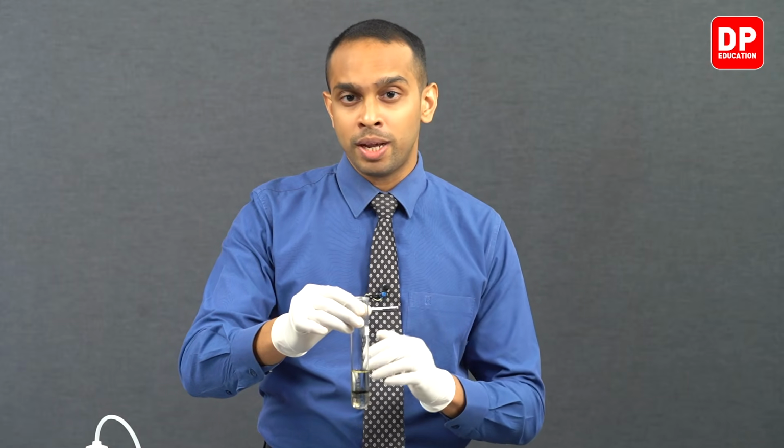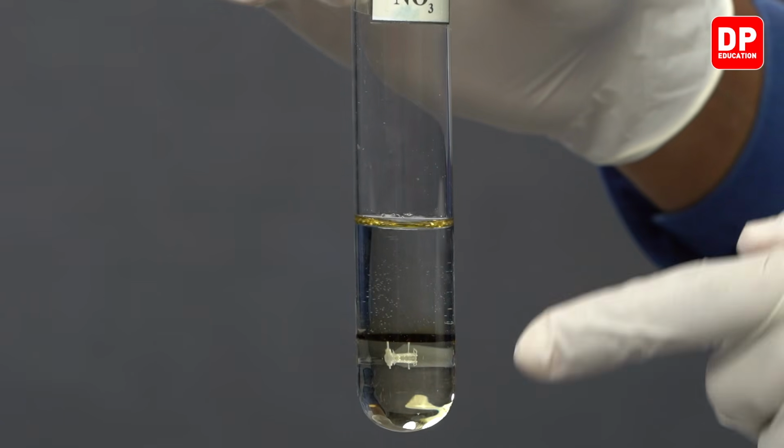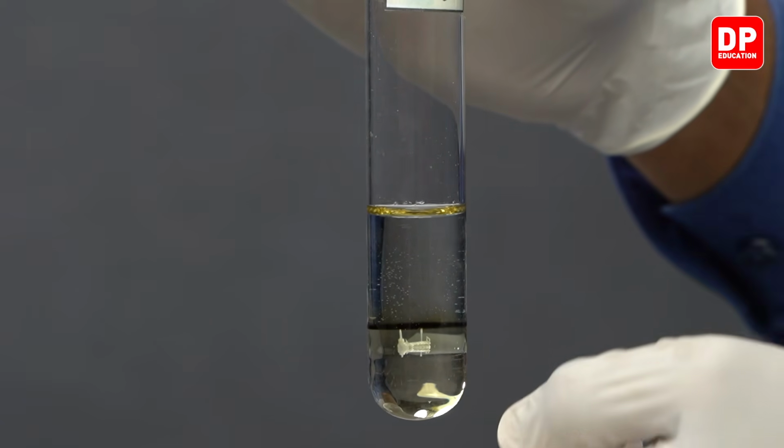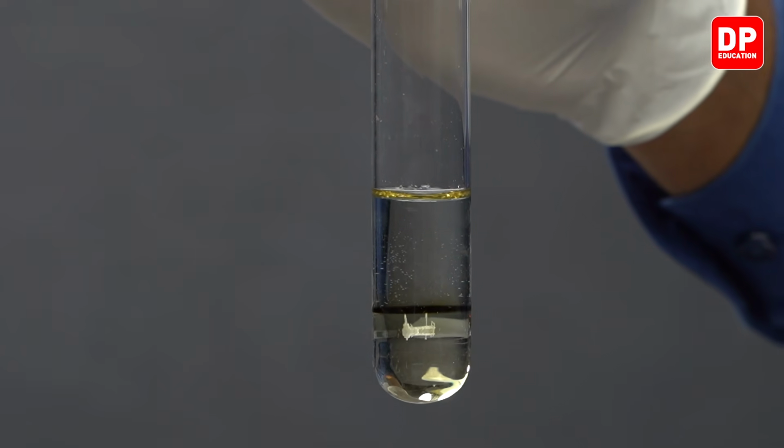With one NO, there will be 5 water ligands connecting to Fe2+ ions, forming a brown color complex, and that is why at the interface we have formed a brown color ring here.